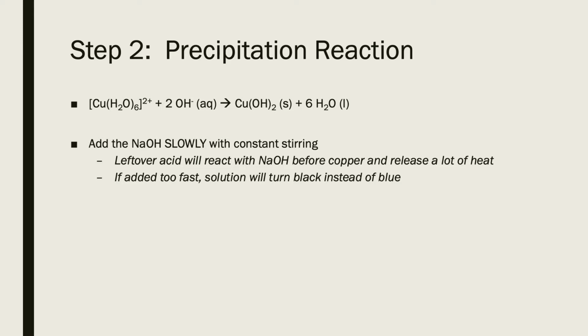But a couple things here, we are using sodium hydroxide. This is a strong base, so we want to be fairly careful. Strong bases, like strong acids, can also be potentially dangerous. And this is a fairly high concentration. I think it's 6 molar for the sodium hydroxide.